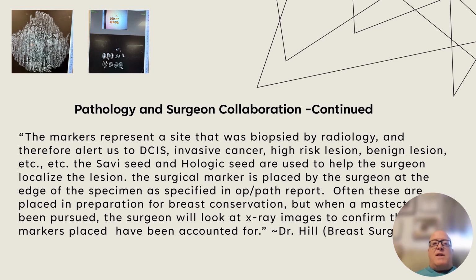If there is an abnormality, they need to take it out. These markers will show and help them go back and take out the area of abnormality. So it's real important that these markers are obtained and verified. It's good patient care.